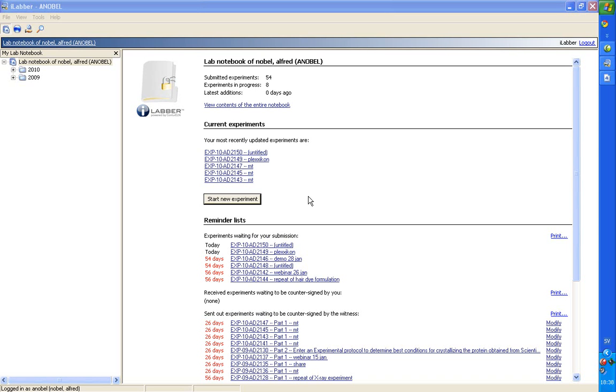Good morning. I hope that most of you at SGC's Toronto are familiar with Contour ELN, but I've been asked to show you some of the chemistry features in Contour ELN.